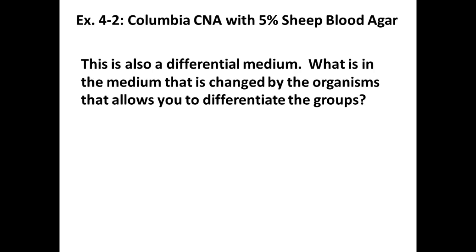This is also differential. So what differences are we going to see? What is in this media that's going to be changed by the organisms? What are we looking for? We're looking for hemolysis, right? And what are they going to do to red blood cells? They're going to lyse them, right?